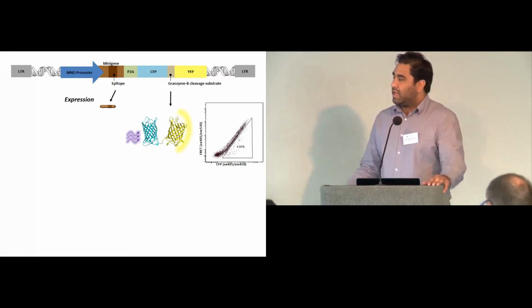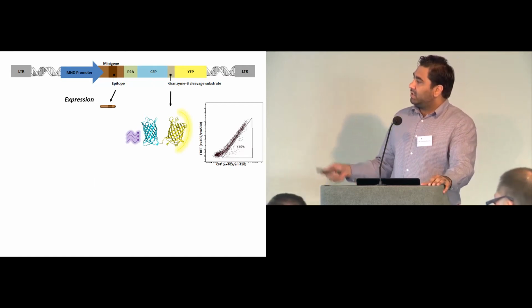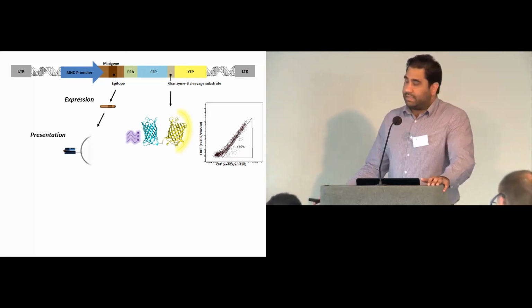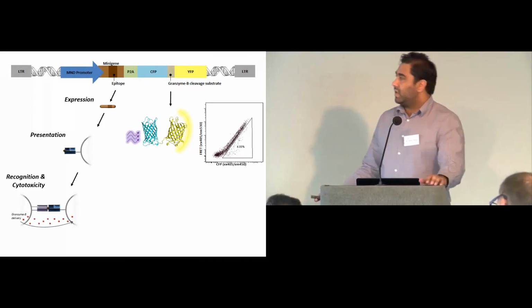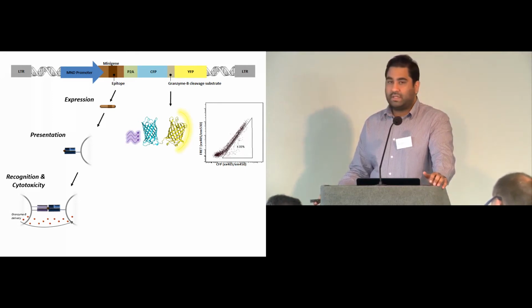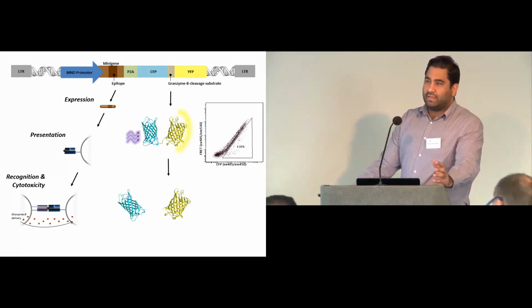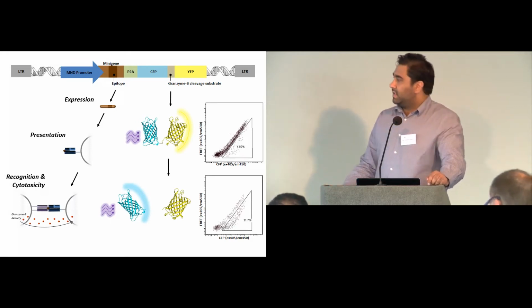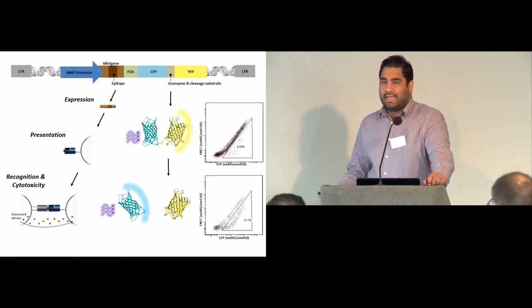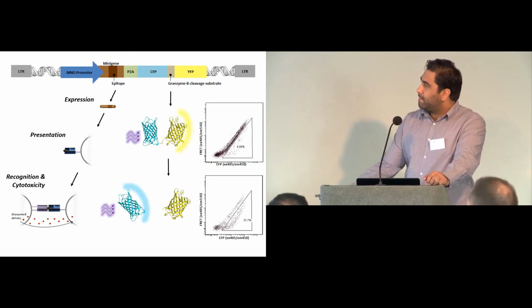So then, should there be a minimal epitope embedded in this minigene sequence, it can be processed and presented and potentially recognized by our T cell of interest, at which point granzyme-B is shuttled over to the target cell. We get cleavage of the reporter molecule, and subsequently a loss of FRET signal coupled to a rescue of the free CFP signal. And that looks like this in FACS. So we get this pronounced shift as the FRET is decreased and the CFP is increased in these targeted cells. And this allows us to very readily gate on only the cells that are being actively targeted by our T cell population of interest. So this fits into our overall library screening scheme as such.